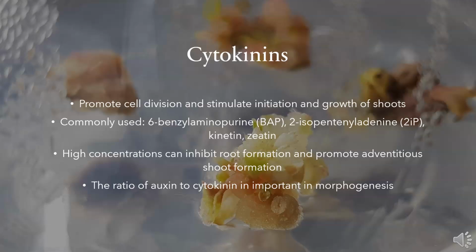The ratio of auxin to cytokinin plays an important role in morphogenesis. A high ratio leads to embryogenesis and root initiation, whereas a low ratio leads to axillary bud and shoot proliferation. An intermediate ratio is required for the formation of callus. For morphogenesis, many plant tissues have an absolute requirement for a specific cytokinin, while some tissues are considered cytokinin independent.